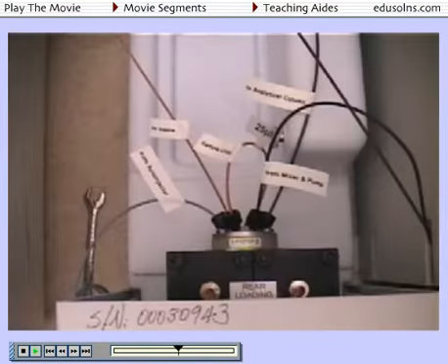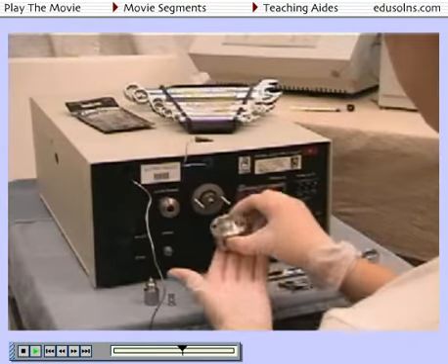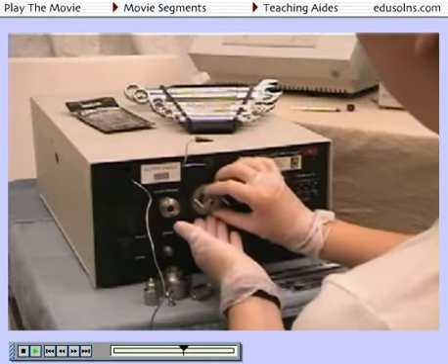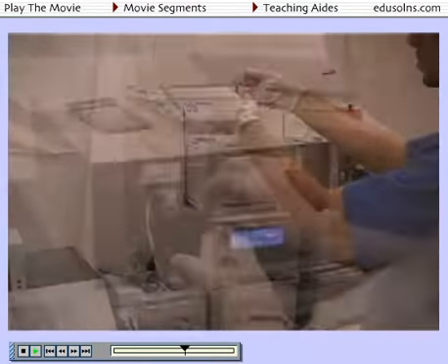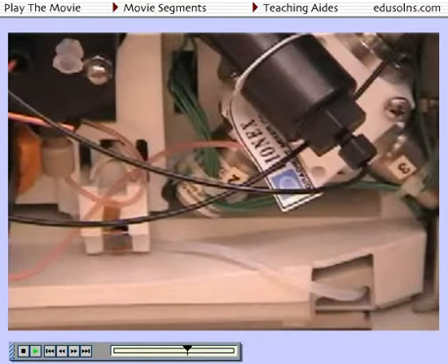Low pressure points in the system can use Teflon as well as the standard stainless steel. Even more elaborate systems use materials such as titanium or PEEK. The system shown here uses PEEK in order to minimize contact with metal surfaces. PEEK is short for polyether ether ketone.